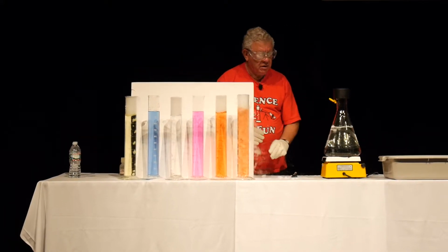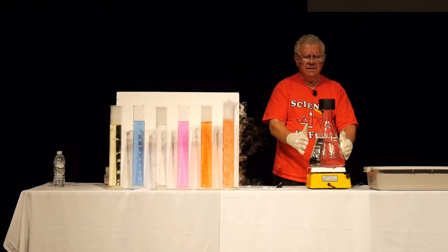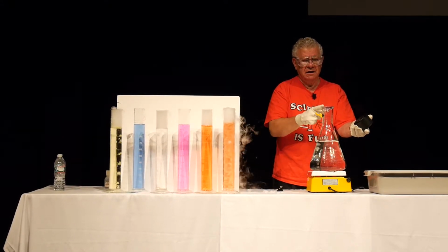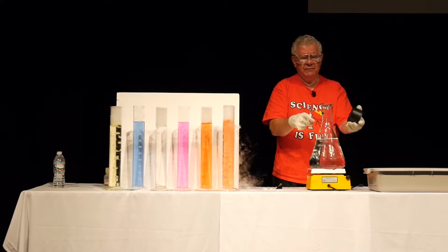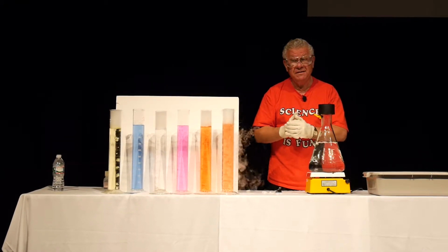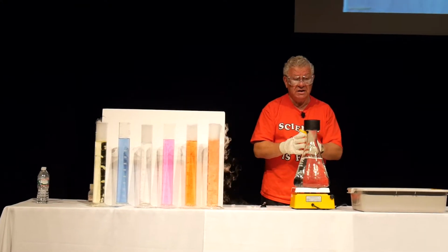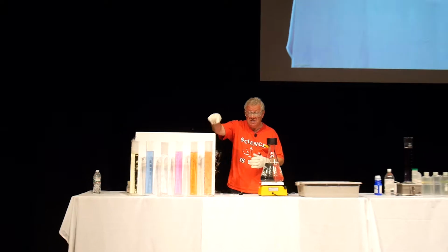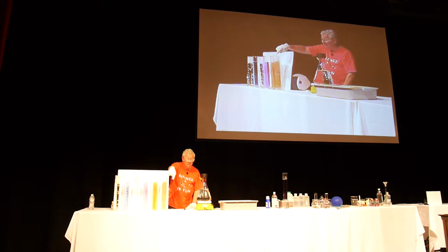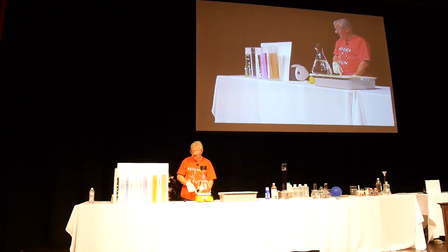Now I also want you to look right over here at this big conical flask that has a side arm. It's open right here. If I open it like this, do you see anything coming off the top? Anything coming from the side? What do you see? This is water boiling. Steam is invisible. You can't see steam. What you see is condensed water vapor. So the condensation is taking place, and in this case, the condensation is taking place in the carbon dioxide gas, and it's floating downward. In this case, it is floating up because there's no carbon dioxide in here at all.